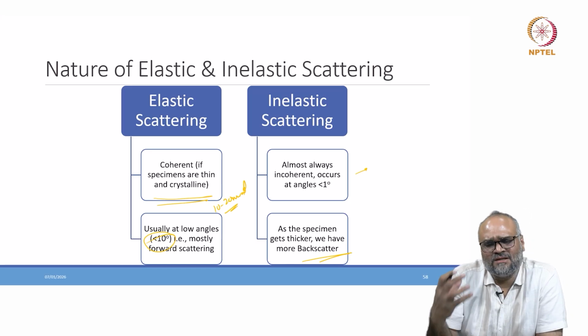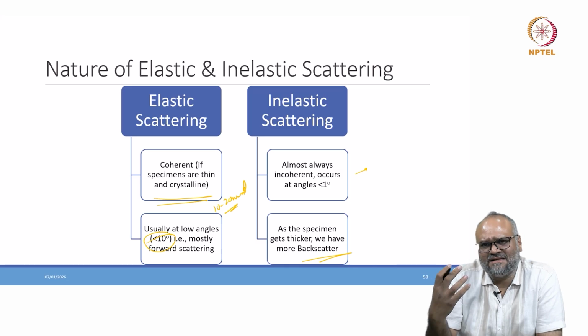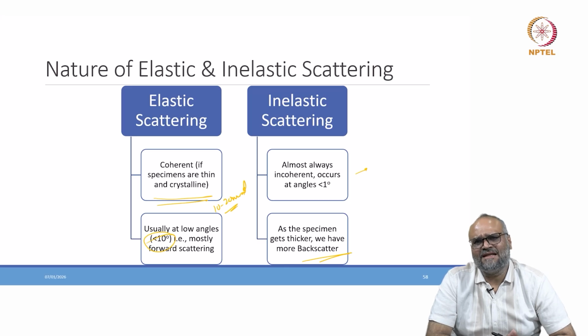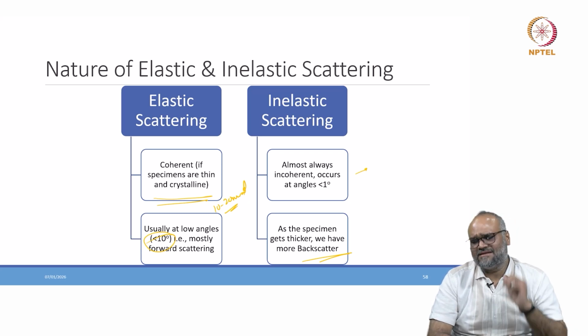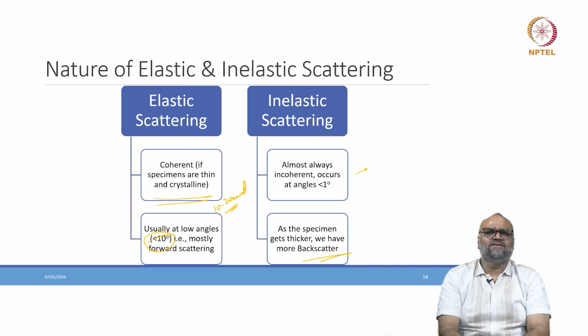Having an idea on the direction of the inelastically scattered electrons or X-rays is helpful. In fact, X-rays emanate all across the 3 dimensions of a specimen. This is usually helpful in designing the detectors and positioning them and where they enter close to the specimen to collect the optimum signal.